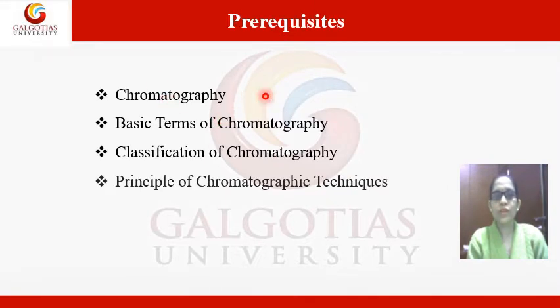What are the prerequisites of today's class? You should have basic knowledge of chromatography, the basic terminology used in chromatography, the classification of chromatography, and the different principles used in chromatography.